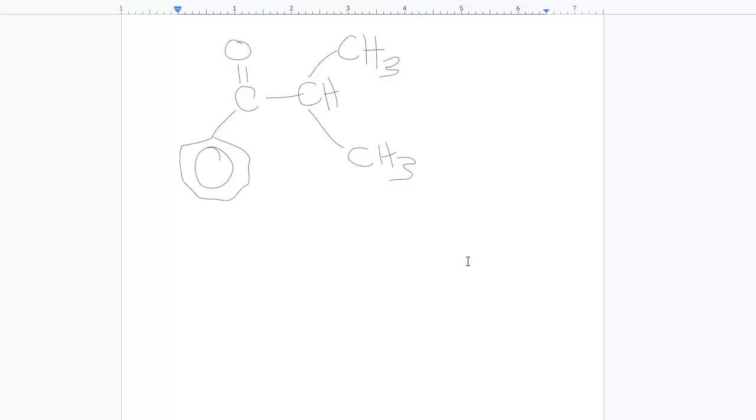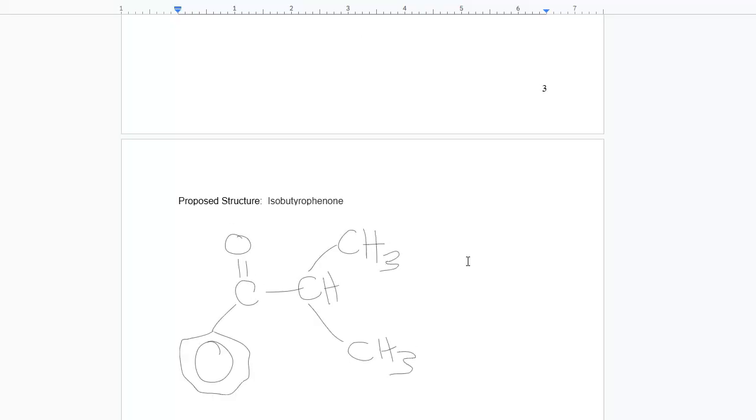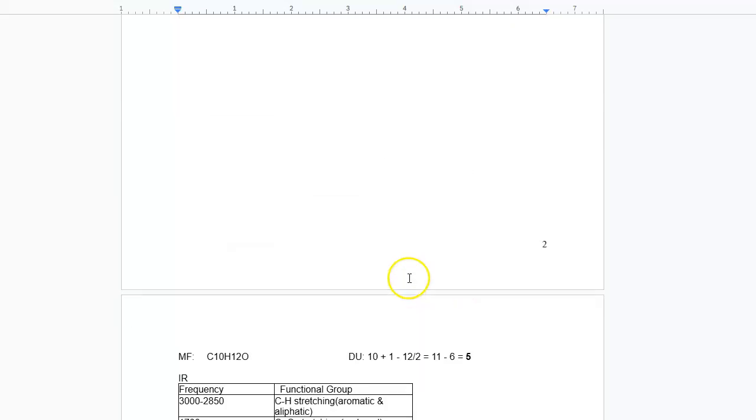This problem demonstrates how spectral data from multiple sources can be integrated to propose a given structure. And each piece of the evidence contributes a clue, and then combined they paint a full picture of the molecule's identity given here.